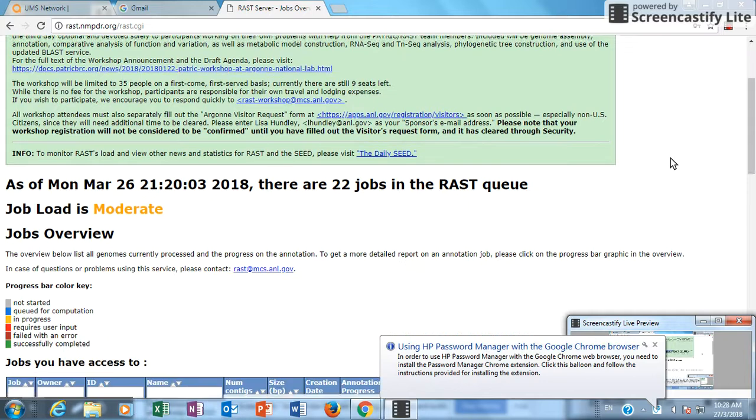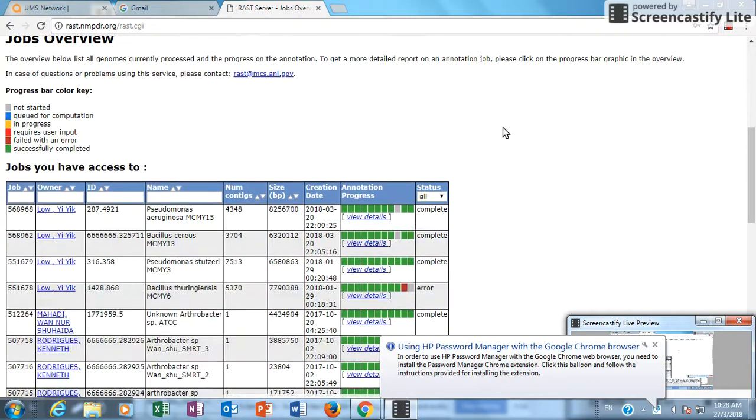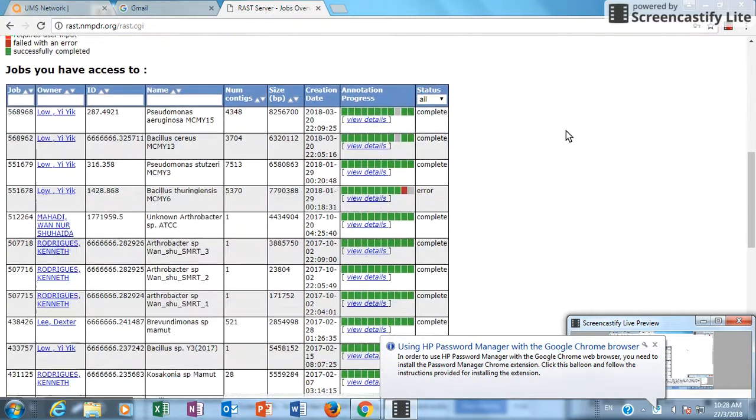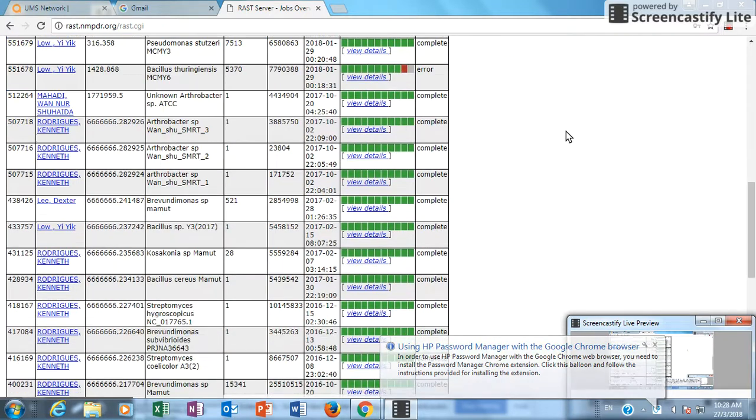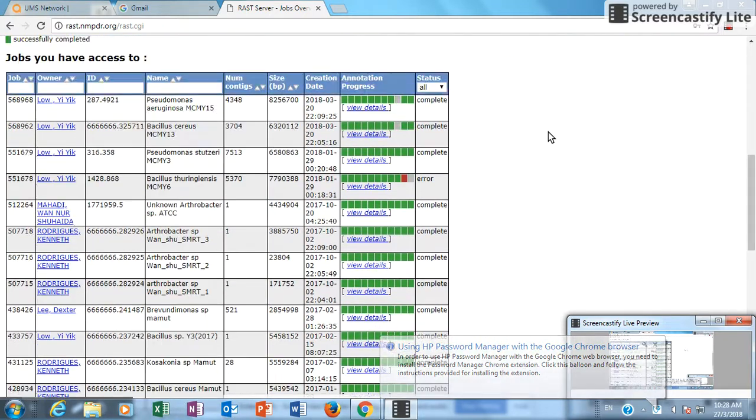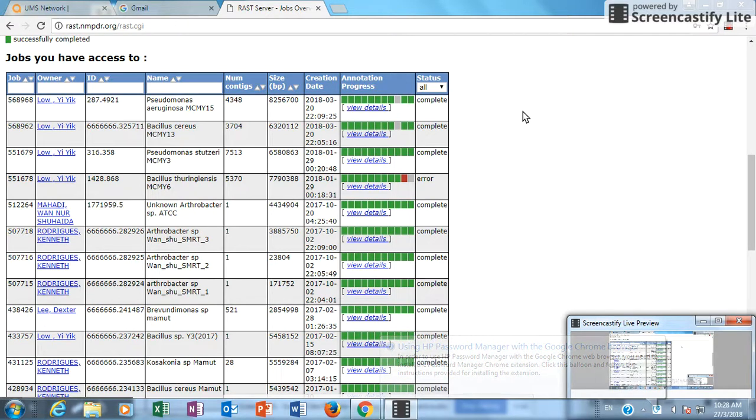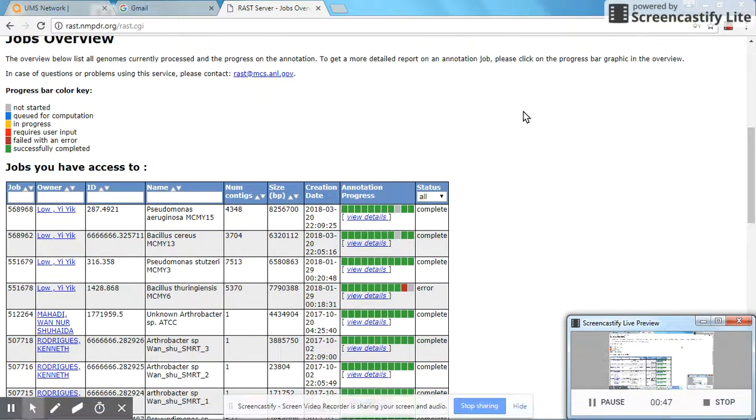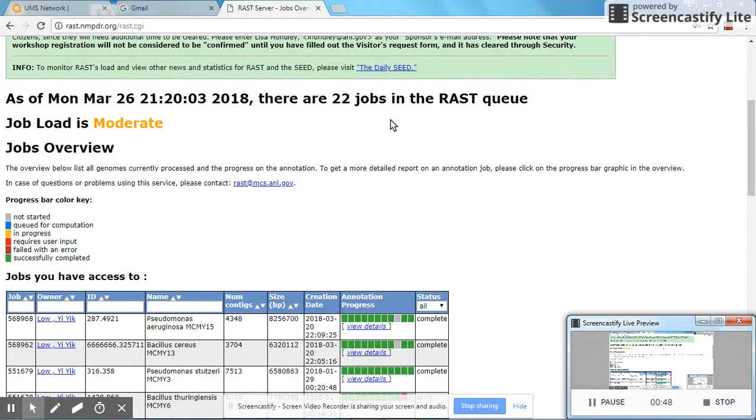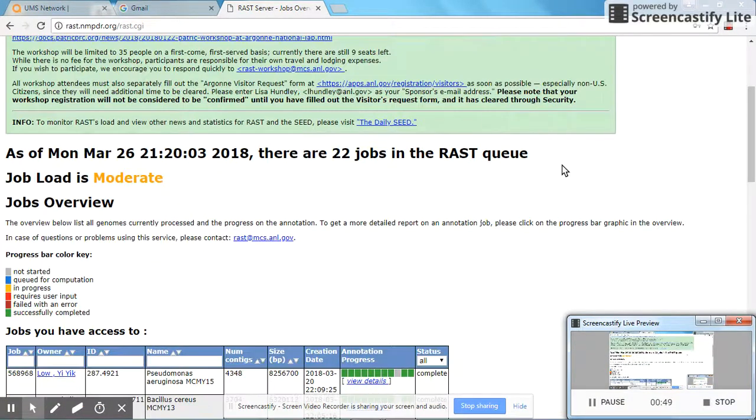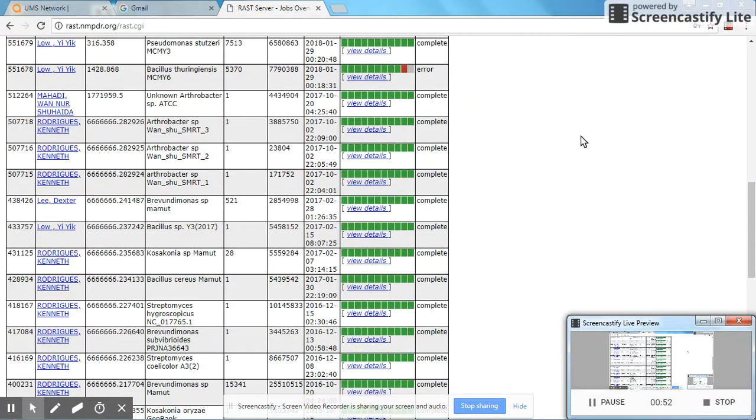The RAST system operates by managing your data. You need to upload your genome data into RAST as an assembled file. Once it's uploaded, the system will annotate the data and present you with a graphical representation of the data.